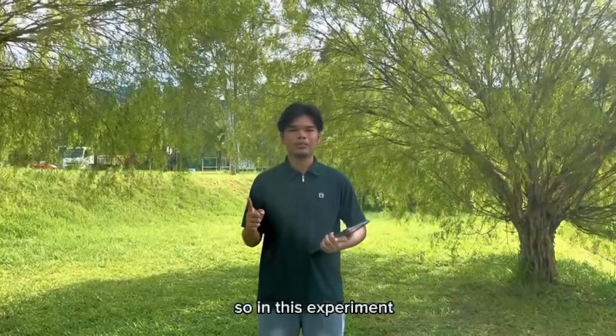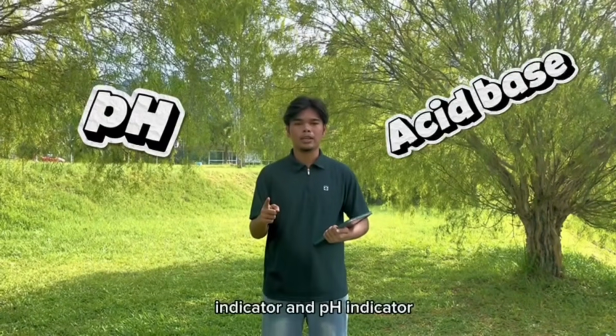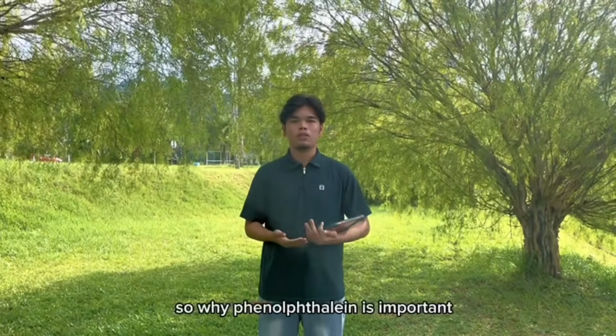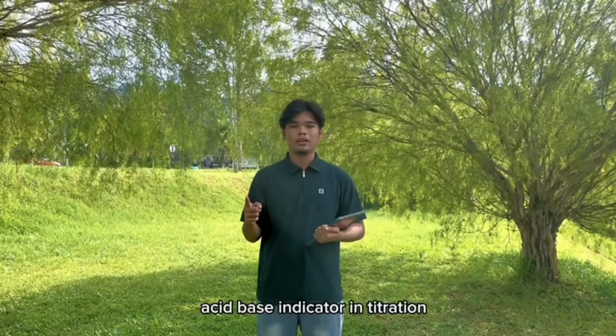In this experiment, the indicator that we use is phenolphthalein. So, what is phenolphthalein? Phenolphthalein is a classic acid-base and pH indicator that is used in laboratories and industry. Why is phenolphthalein important? It serves as a fundamental acid-base indicator in titration.